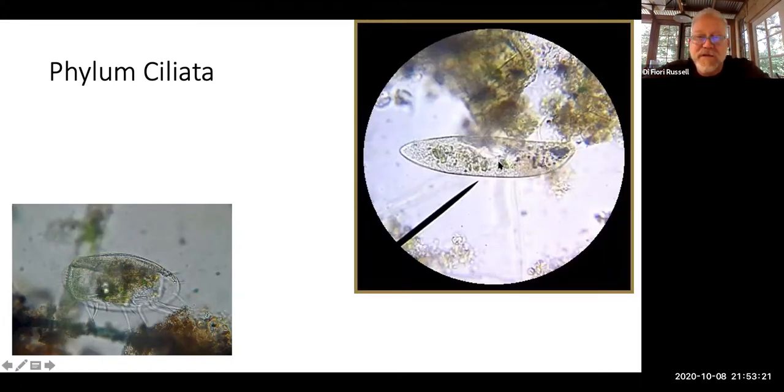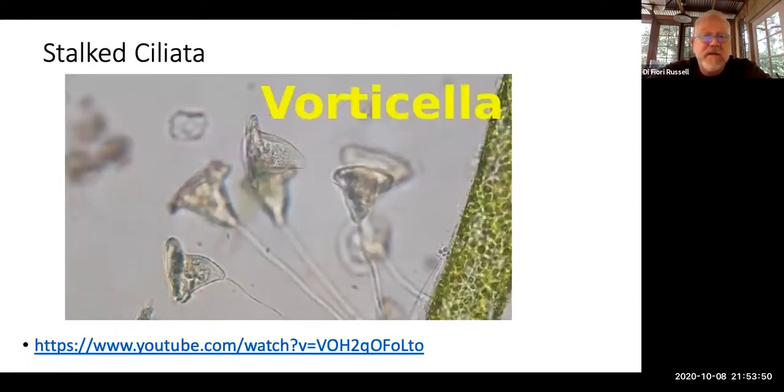These are all single-celled. You might find algal cells within them because they've eaten them. So sometimes you'll see little green algal blobs inside that, but it's only because they eat them. And sometimes you'll see them buzzing around in the water column and hitting something and then tearing it apart like a little chainsaw. They can do that to help tear things apart and then eat the parts that they get. I'll show you in a moment a little bit better video of them moving.